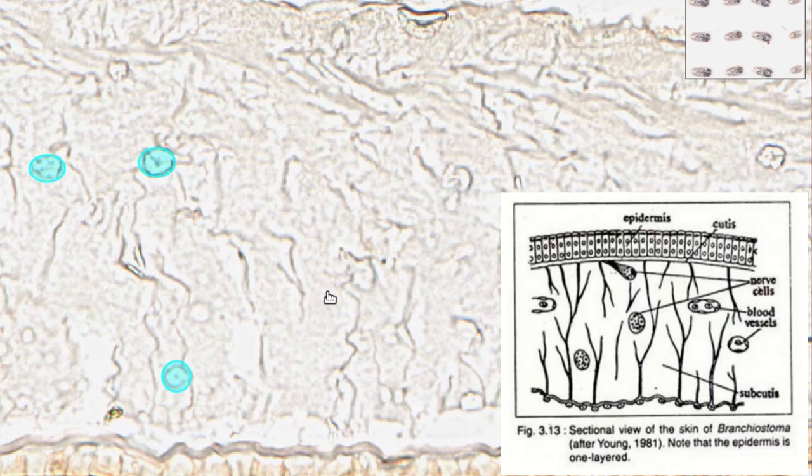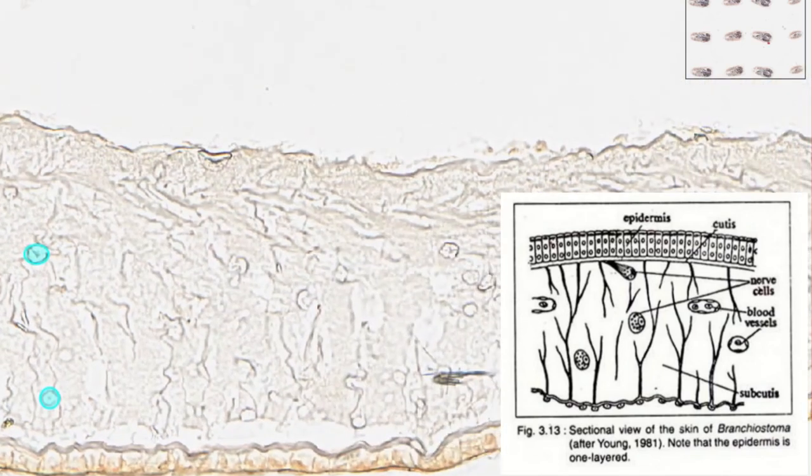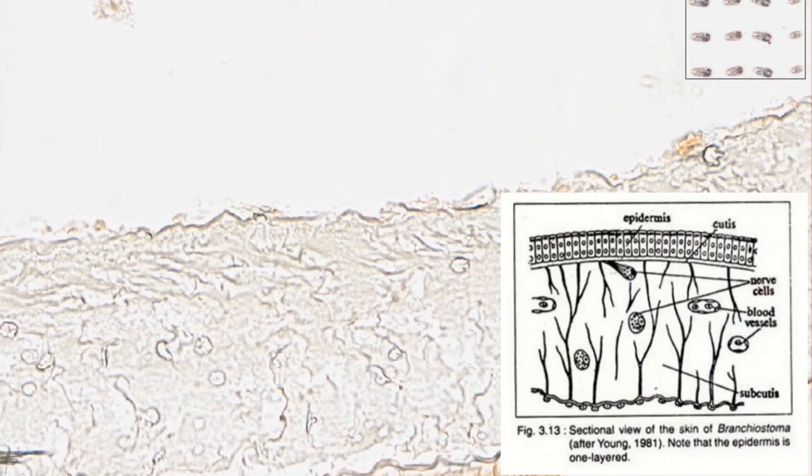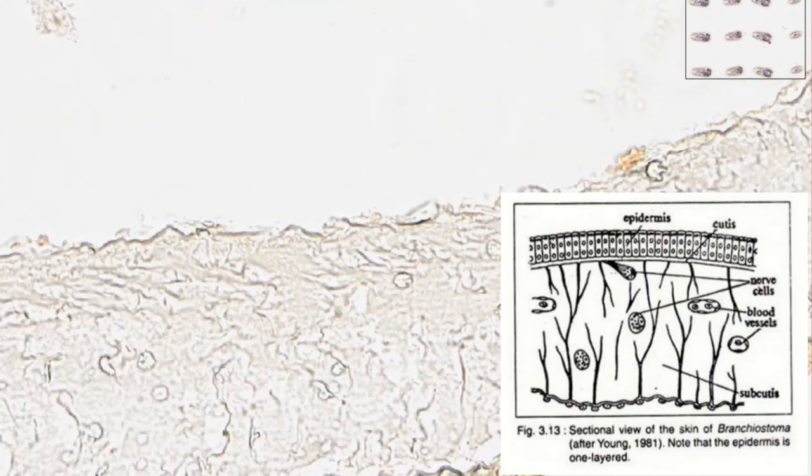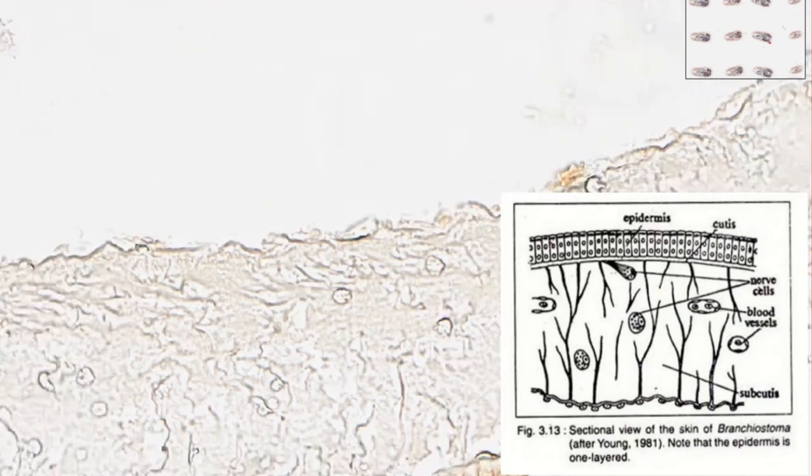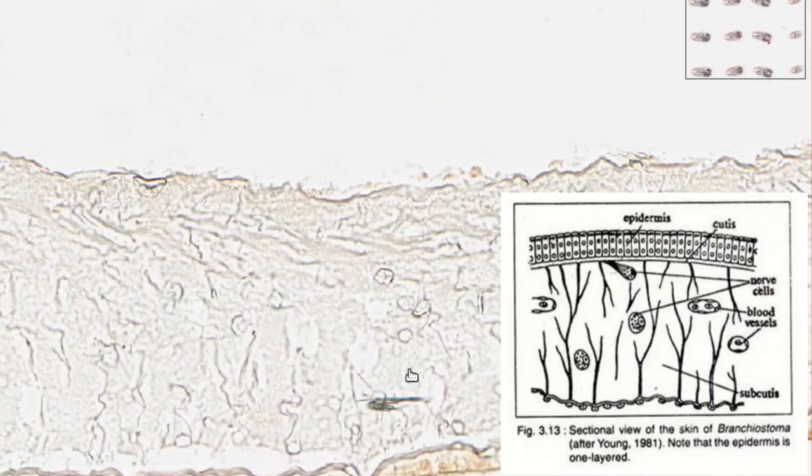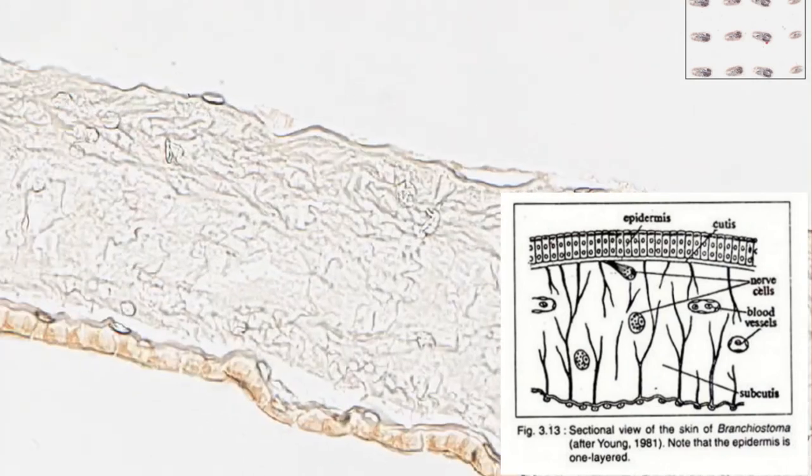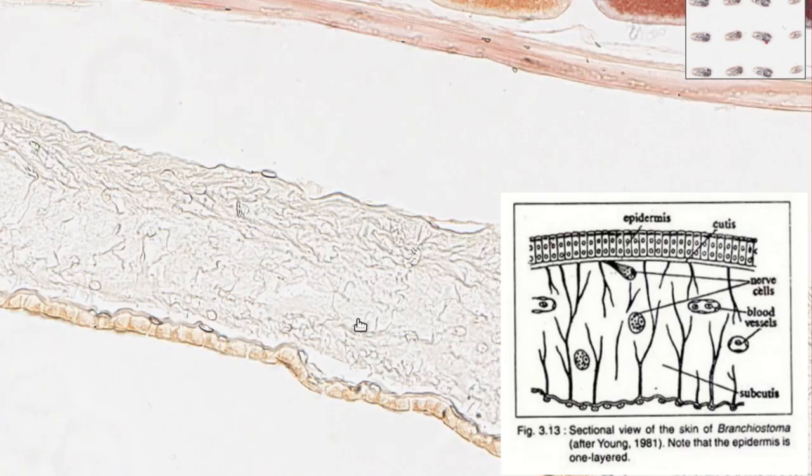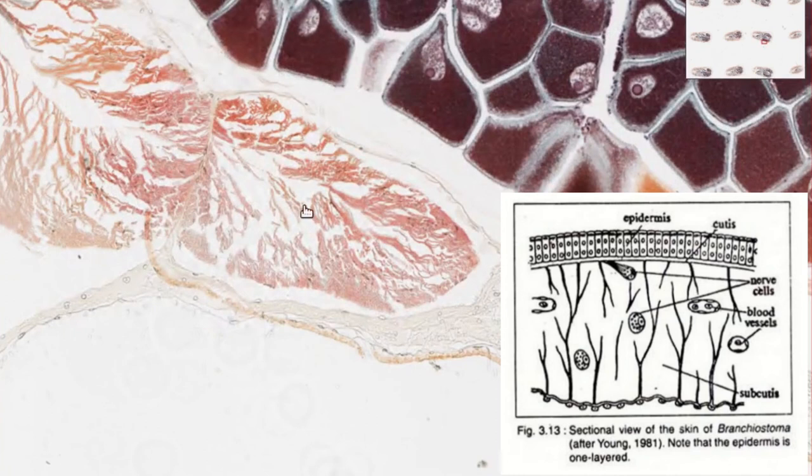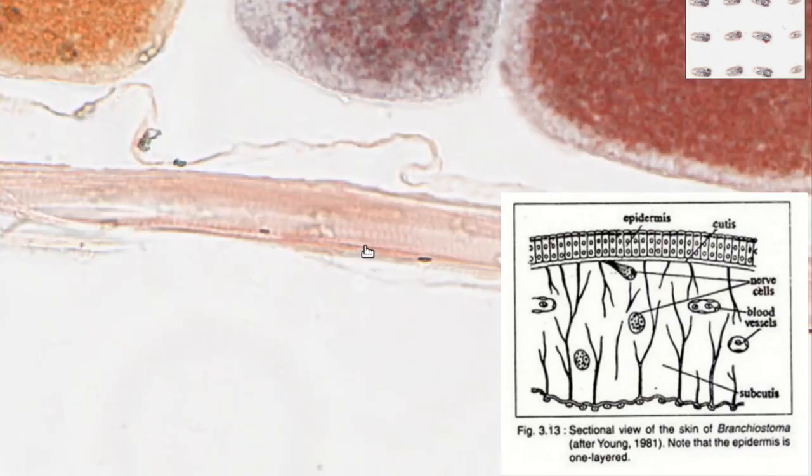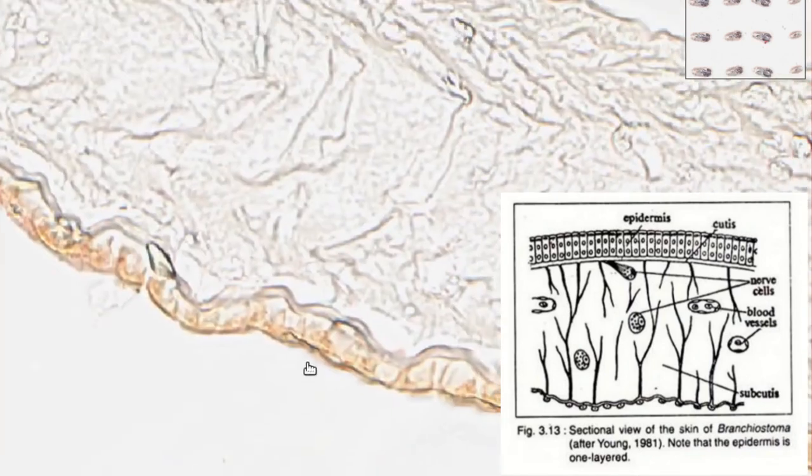They don't have any blood cells in them, so they're quite hard to identify. Often in other higher organisms, you'd be able to identify blood vessels by blood cells. Or in the worm slides, they were filled with kind of a pinky fluid, but that's not stained in these sections. So we have to rely on just their outlines to be able to identify them. So there's quite a lot you can see here, blood vessels within the subcutis.